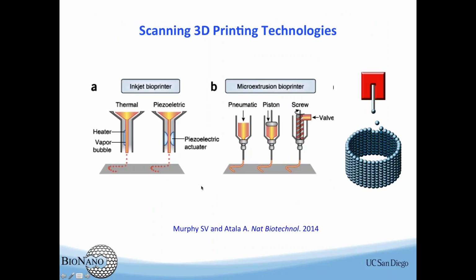Okay. In terms of creating these tissues, there are different ways, and I would like to focus more on the printing part. So traditionally, you see all these printers are based on either inkjet or extrusion type machines. And I have to say that these are excellent machines, and they're low cost, very easy to use. But certainly, there are also issues associated with these. And I do have such a printer in my own lab, but unfortunately, none of our students want to use them. There are several reasons.